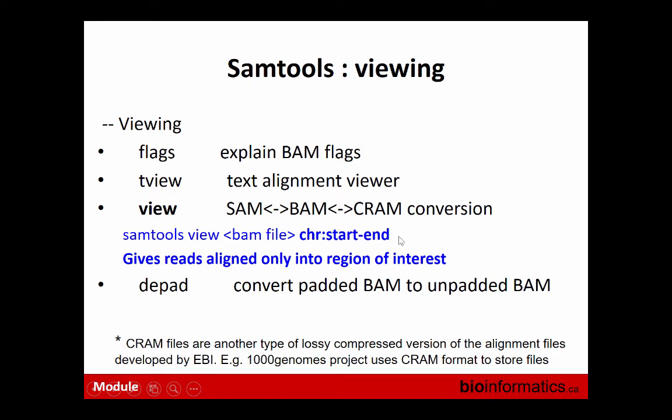And if you run your experiment and you would like to quickly assess whether you have enrichment at a certain target, you can answer your question in 5 minutes. You run this command, and you see your enrichment in this particular region, you get, say, 1,000 reads. You take a region of the same size, but randomly on the genome, and run it 5 times, and randomly on the genome you have 5 reads, but in this particular region 1,000, so you are absolutely sure that at least this part is showing enrichment. So it's a good thing to know.